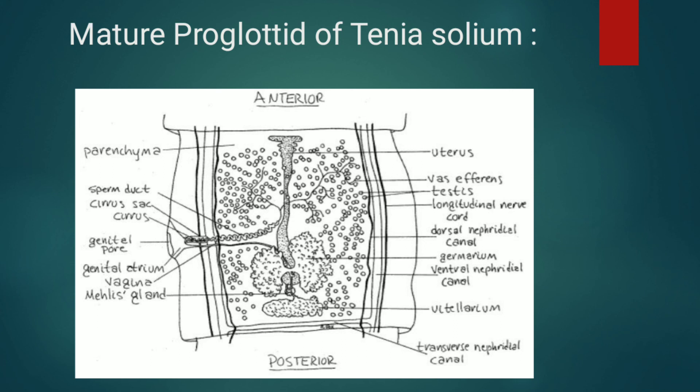The male genital system consists of follicular testes, vas deferens, and cirrus. The oviduct divides into two ducts: one leading to the vaginal opening and the other into the uterus. The vitelline gland lies behind the ovary. Male and female reproductive organs open into the genital atrium, which opens by a common gonopore on a swollen genital papilla. This is all about the mature proglottid of Taenia solium.